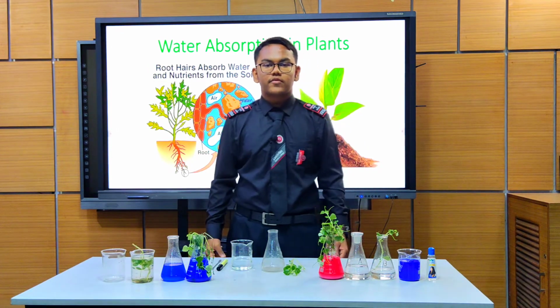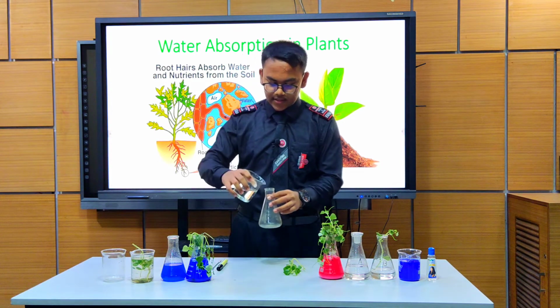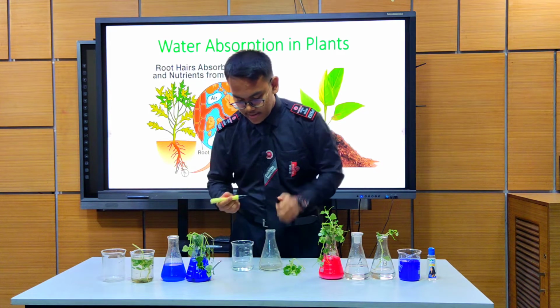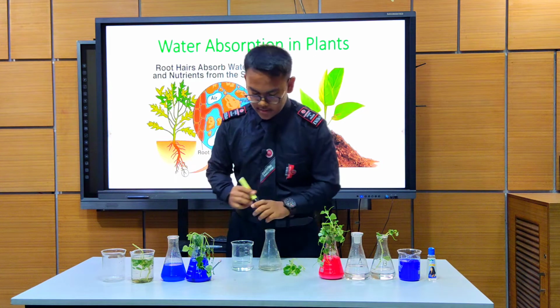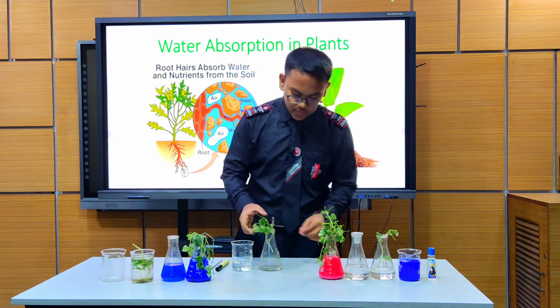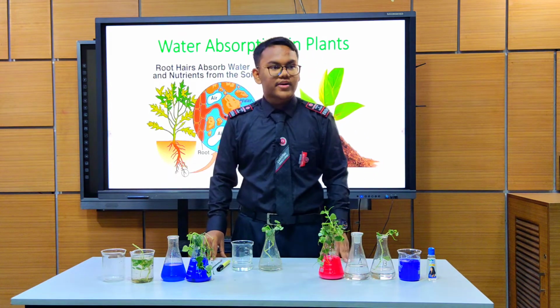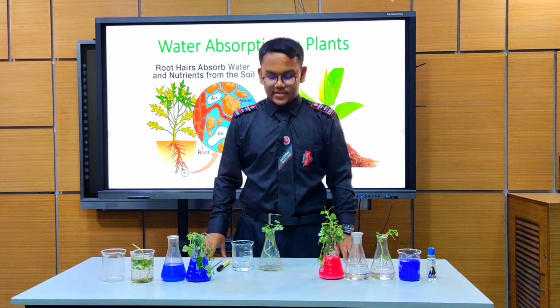My name is Jubran. I will show part D. First, take a conical flask and pour some water into it. Fill the flask with 1/4 part of water. Then mark the water level. Then keep a plant in the conical flask and wait for 24 hours, and let's see the observation. Now my part has ended. Now my friend Alif will do the observation part and show us what the result is.